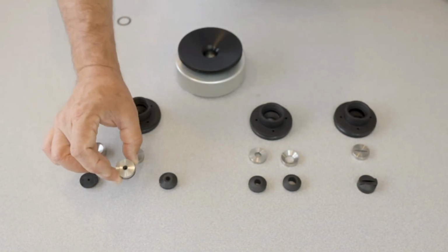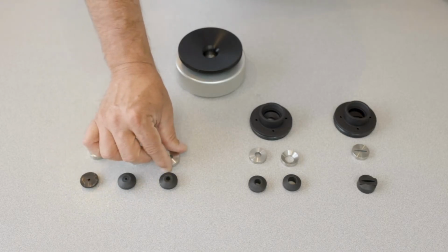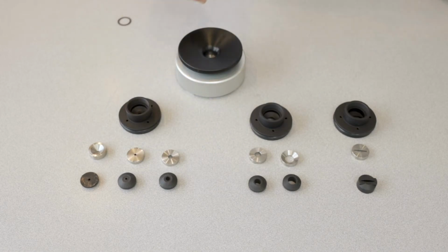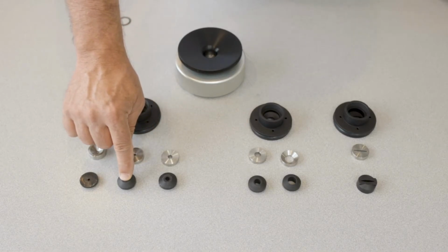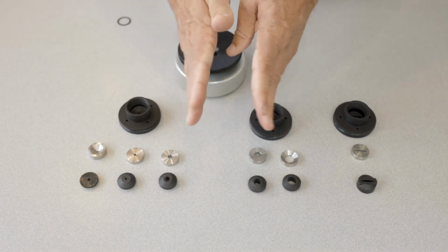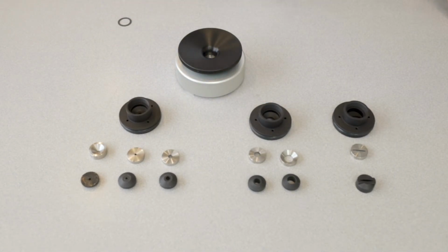And that system works great if you're doing almond, or if you're doing almond and walnut, and you need to be able to do both in the same lid. That's a great option, because with the almond, the petiole will just barely stick through the top of the gasket and creates kind of a soft squeeze on that almond petiole. So that's a great system for that one.